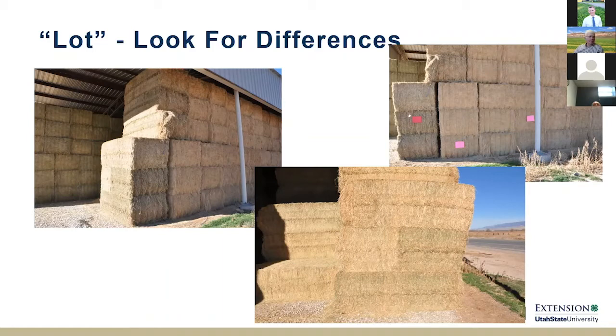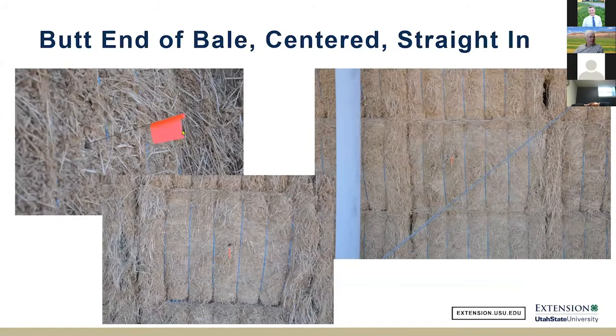The photo on the bottom right shows the center of the bale, the little fluorescent flag going straight in. The upper photo shows a tube going down on an angle, which is not following protocol. The special circumstances on the right, you can see there's a guy wire supporting the hay cover building. And the individual that sampled this stack before I got there had moved over to the left and upper quarter of the bale, taking the core there, which will build in biases into the sample because of the position in the bale. I'll come back to that concept again in a few minutes.